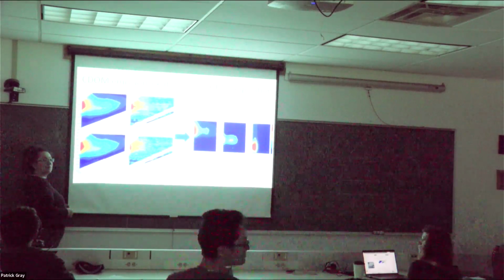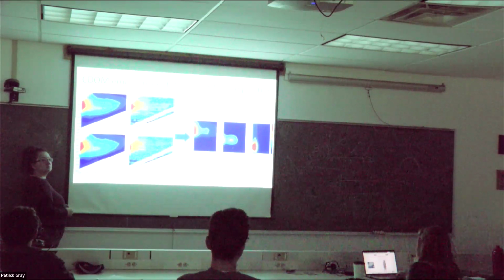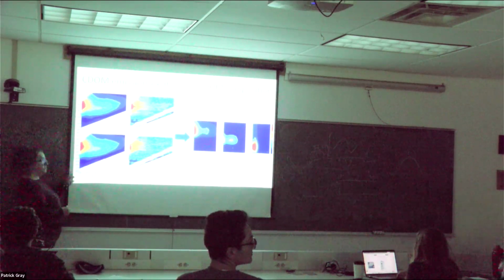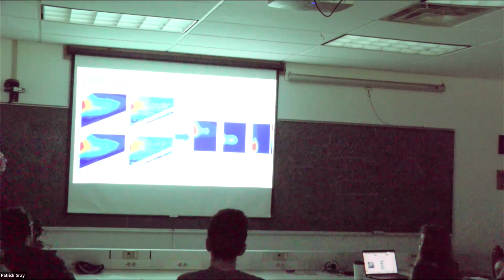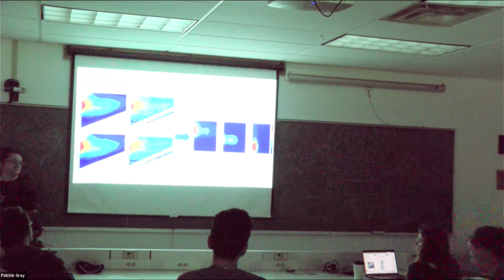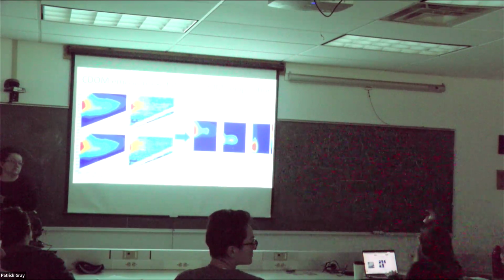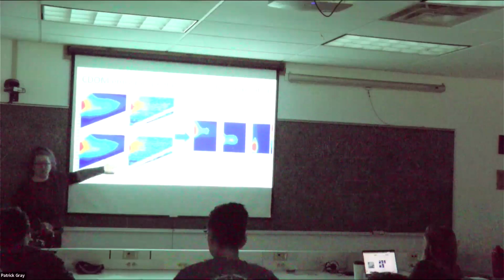Also, if you shoot a light at like 250 and then you look at 250, you're just going to see Rayleigh scatter. And you'll get the whole data set when we run these this afternoon. You're going to have Rayleigh scattering and the Raman scattering off water, which is huge and overwhelms everything. So a lot of times they just cut it off. It doesn't look bad, but it makes sense where there's nothing here.